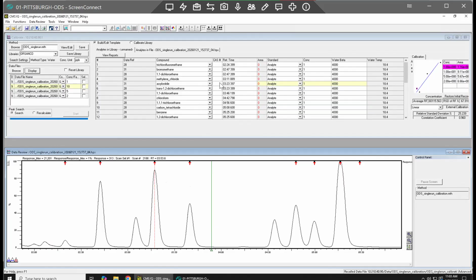So I like to work backwards to front because as you start changing them, you want to just make sure, little blips like this are probably not real peaks. So when you're going through and trying to make sure you're lining up, because obviously we don't have a mass spec with this, we can't confirm the identity of the peaks. So we're just going in order of what we already have in our list. Or I do have a model chromatogram that I have printed out that I will look back at, just to make sure that all my peaks are in order.